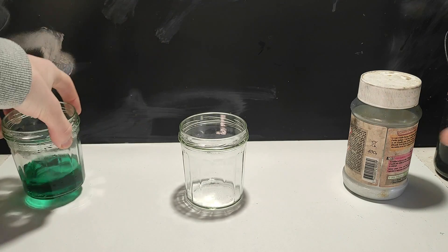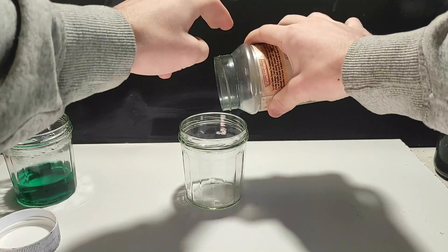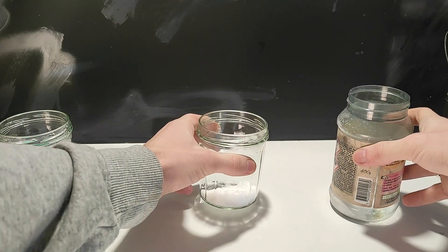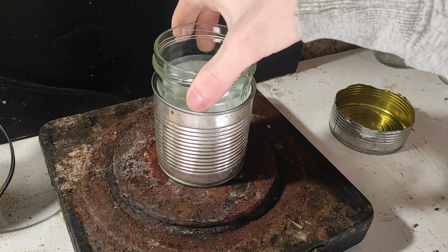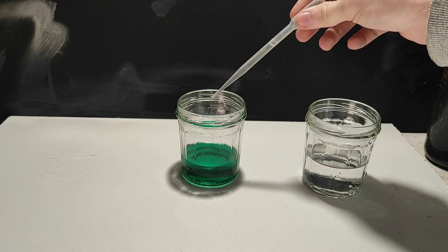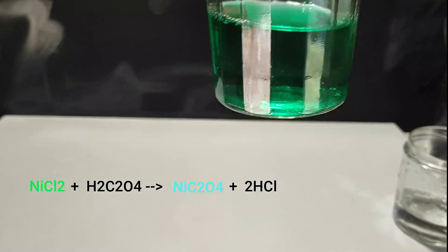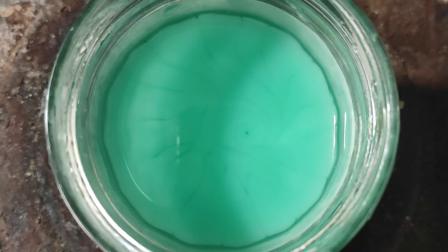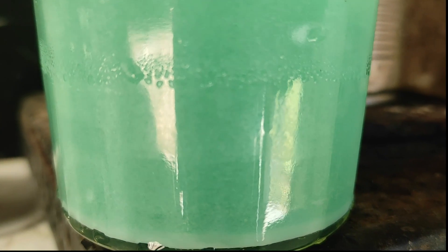The next step is to precipitate nickel oxalate from the green solution of nickel chloride. To do that, I first prepare a solution of oxalic acid by taking some crystals and putting them in water that I heat up to boiling — we need to heat because oxalic acid is not very soluble in cold water. I expected the reaction to be fast with an immediate precipitate, but I had to wait several hours for everything to precipitate. Nickel oxalate is insoluble in water and will appear as a beautiful light blue suspension. If you see some unreacted oxalic acid precipitating, don't worry — just heat back on the hot plate before filtering.